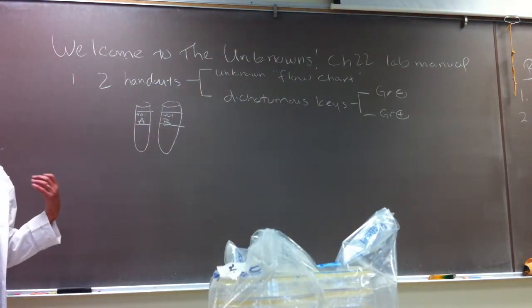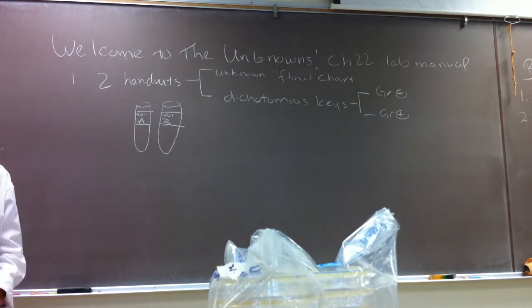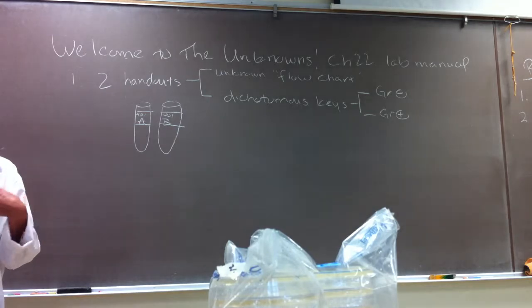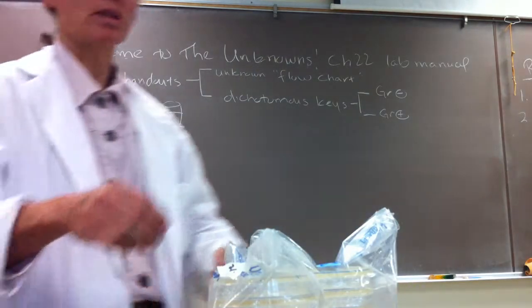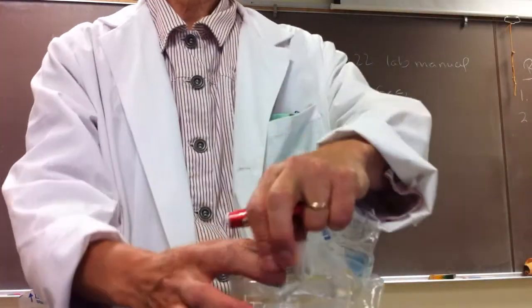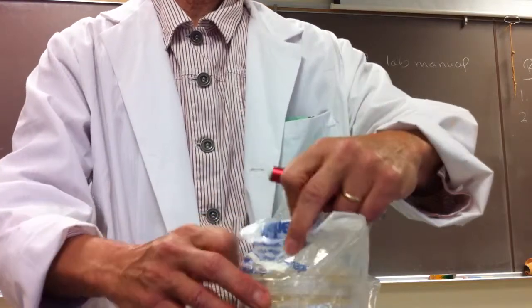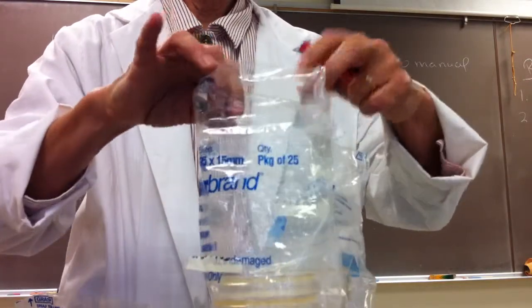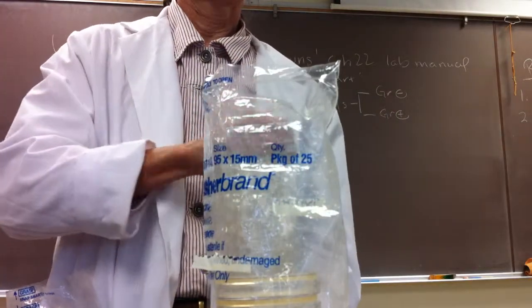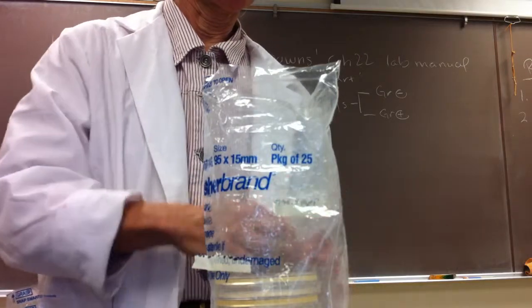So why don't we right now go ahead and just do these steps as we're talking about them. So if you guys will pull out your test tube racks, and if you don't have enough, it'd probably be best to give each person a test tube rack. Just let us know, we'll get you one. And I'm going to come around and let you choose your unknowns right off the bat. Okay, so you're going to have hands on while we're doing this. And the other thing, you guys, we might as well do right now, each person is going to need 4 TSA plates. So why don't we take just a little bit of time to get our test tube racks out, and also for each of you to come up and get 4 TSA plates, okay? And then we'll continue our discussion of what all we're going to do today.